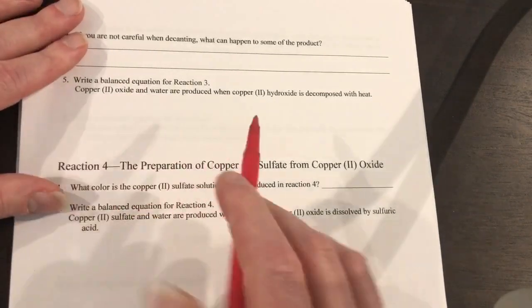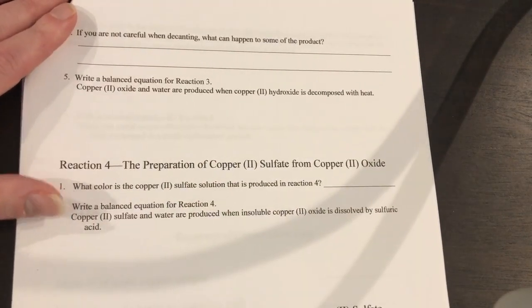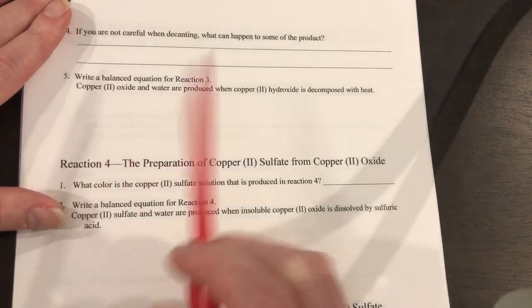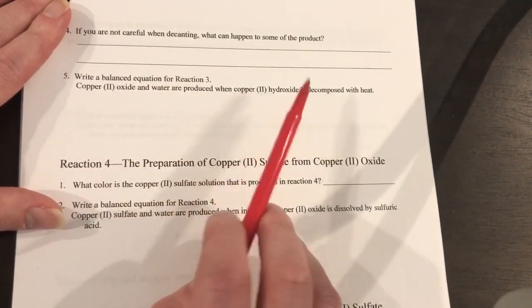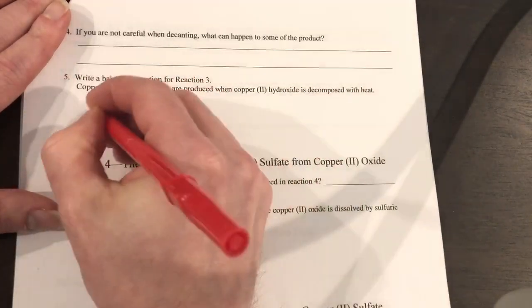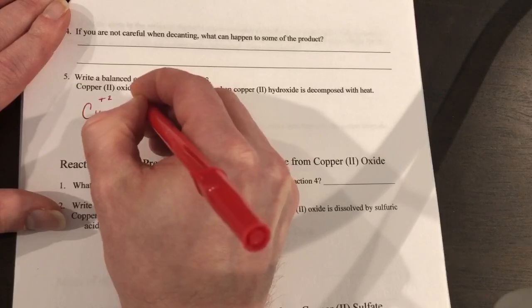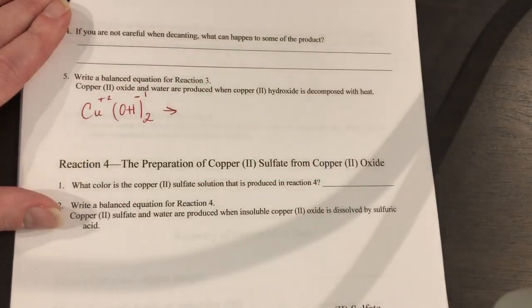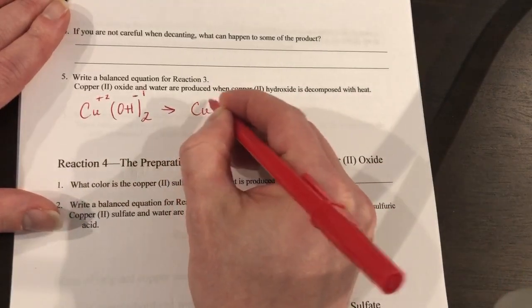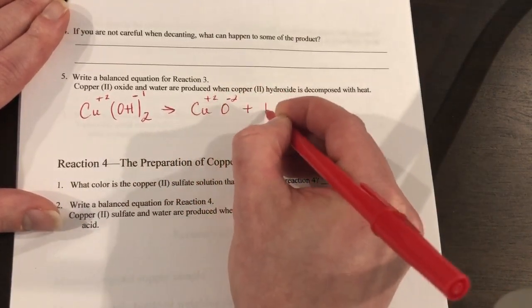Okay, so this is actually written backwards, so don't freak out. It says copper 2 oxide and water are produced when copper 2 hydroxide is decomposed with heat. So copper 2 hydroxide is Cu with a +2 charge, OH with -1, and I'm going to decompose it into copper 2 oxide and water.